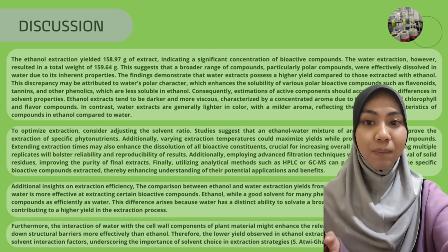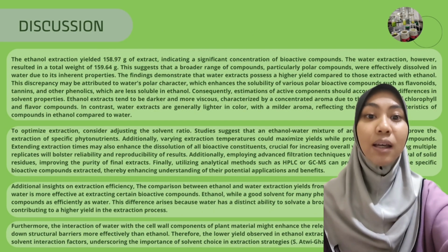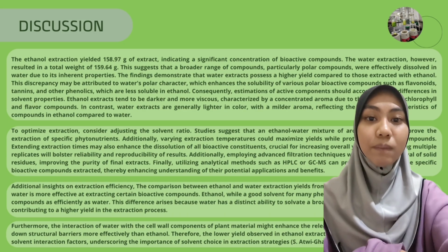This discrepancy may be attributed to water's polar character, which enhances the solubility of various polar bioactive compounds such as flavonoids, tannins, and other phenolics, which are less soluble in ethanol. Consequently, estimation of active components should account for the differences in solvent properties.